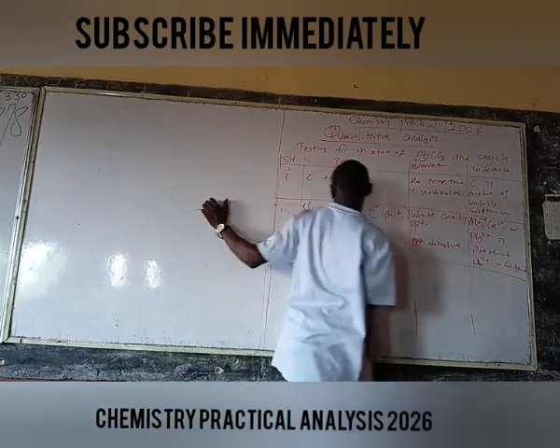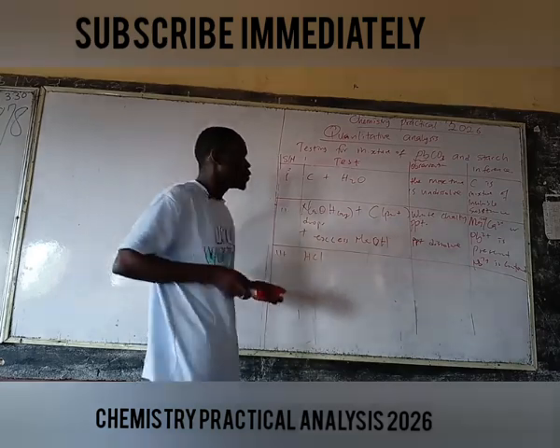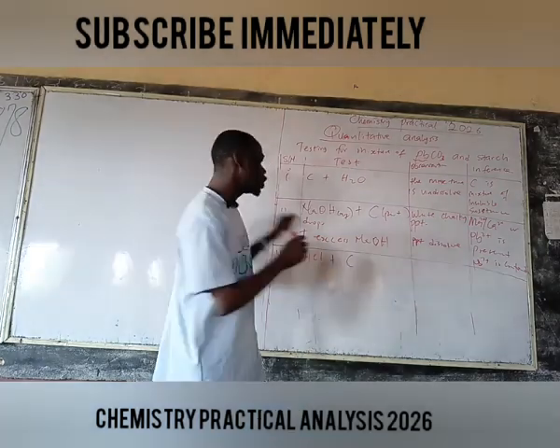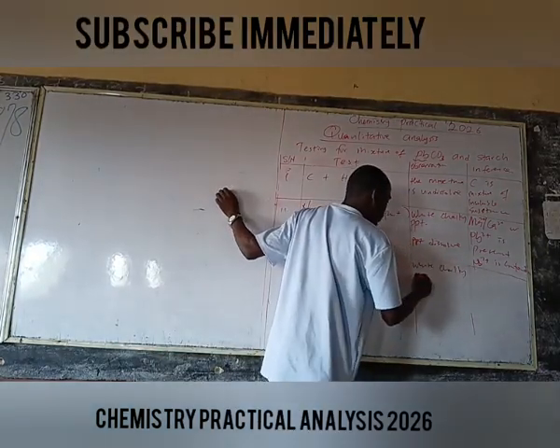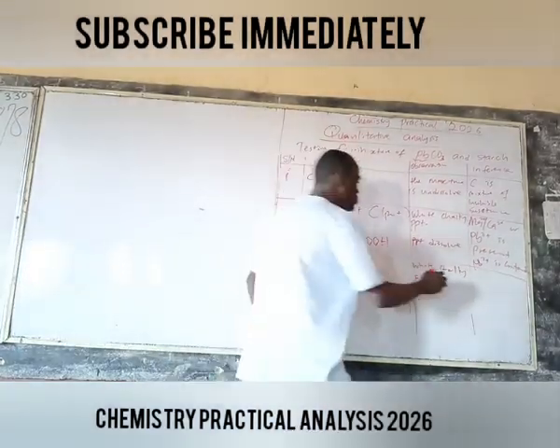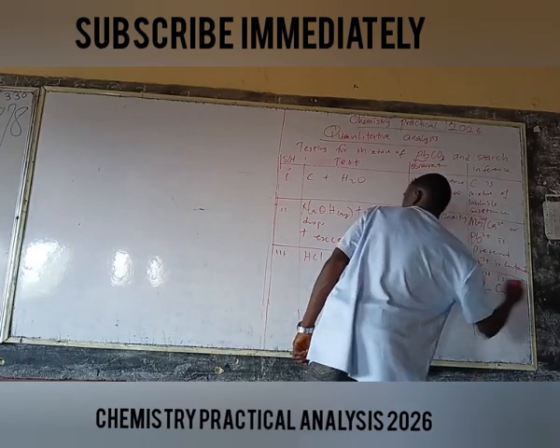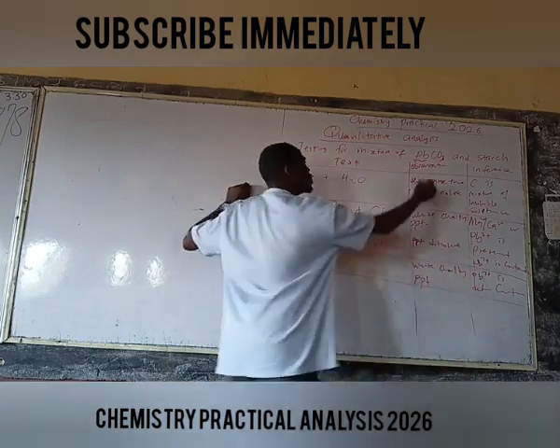Although we can also use HCl to confirm the lead 2 salt. Adding HCl to anything that contains lead, HCl plus C, will also give a white chalky precipitate. Giving a white chalky precipitate also confirms lead. It means lead 2 plus is definitely confirmed. Now, after confirming the cation, let's go to the carbonate.